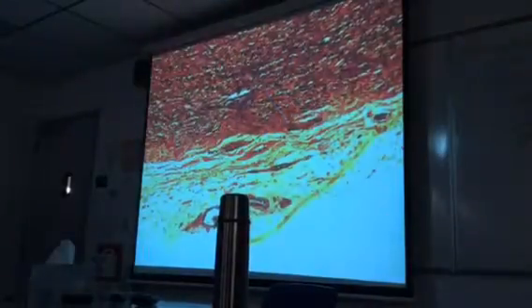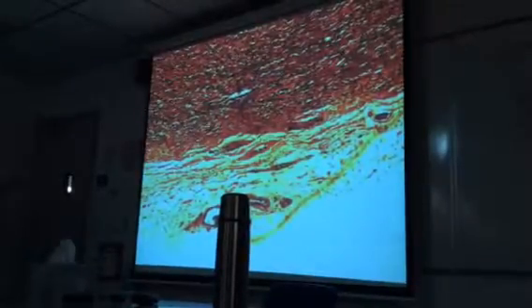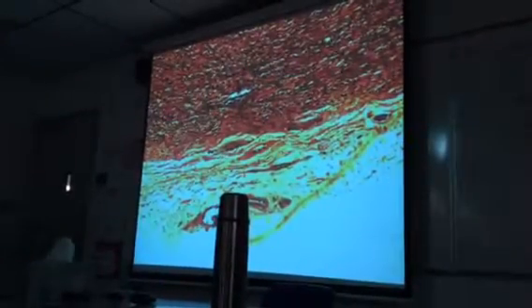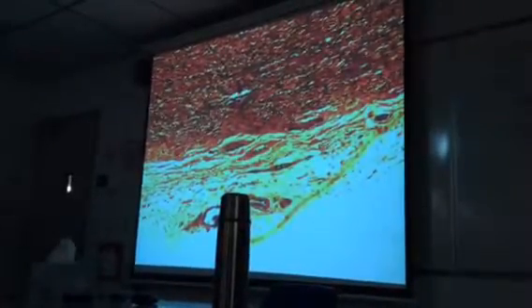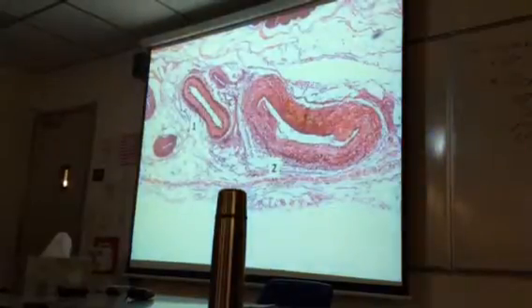Okay? And here's a closer up picture. I like how you can see the black stuff, that's elastic fibers, and the pinkish stuff is the smooth muscle. And those blood vessels are vasa vasorum. Remember, those are blood vessels that supply blood to the big blood vessel. Okay? Here's other pictures of arteries that we have. These aren't elastic arteries here.